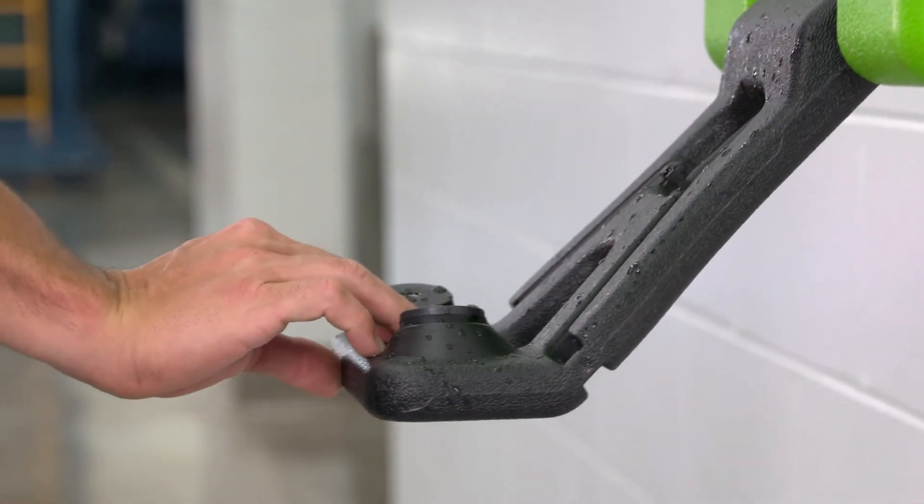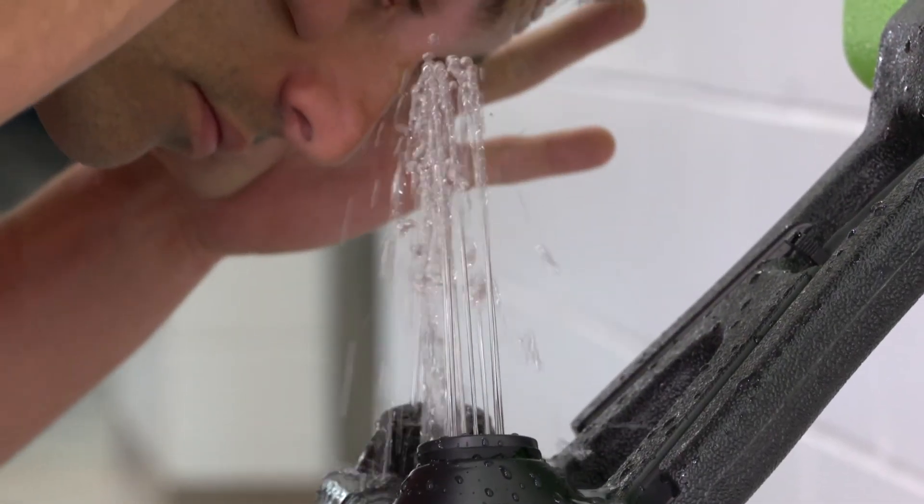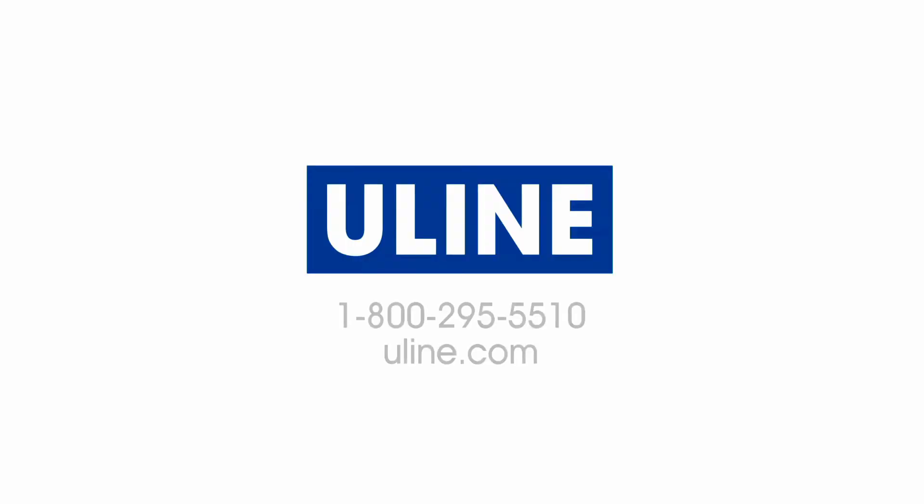Whatever your safety needs are, you can rely on Uline to have the solution.